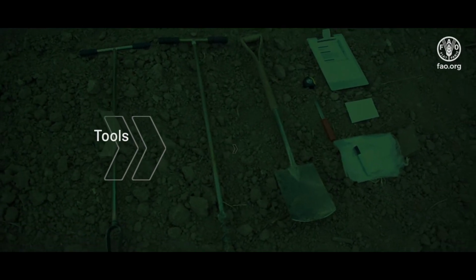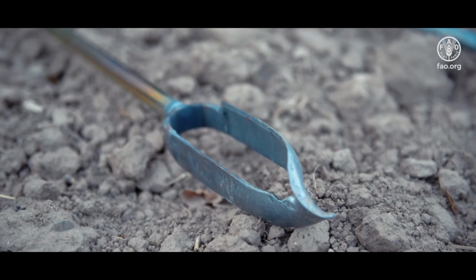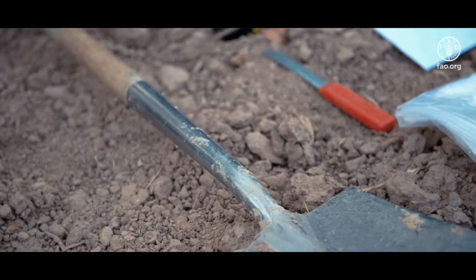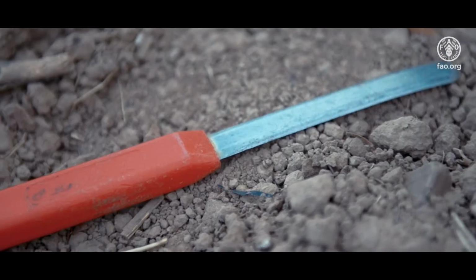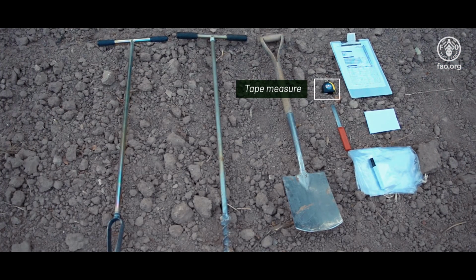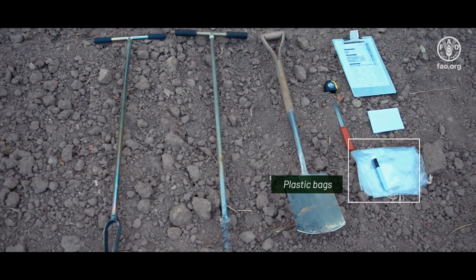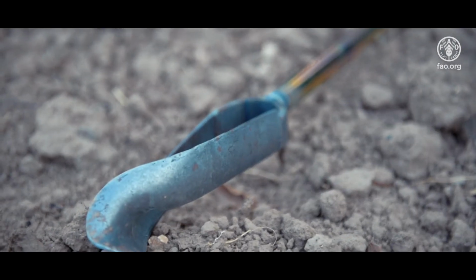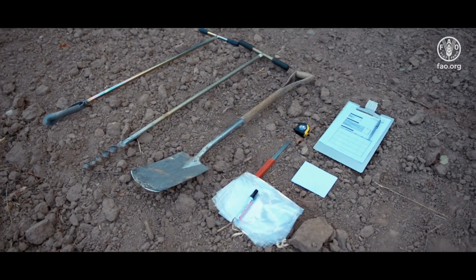First, you need some basic equipment. You can use a digging implement like a sharp shovel or an auger or probe. The implement most appropriate for sampling depends on the soil conditions. For example, in stony or wet soils, an auger or shovel will work better than a tube-type soil probe. In most cases, a shovel is the best option, since it's easily available. Other equipment needed are bags, a marker, etc. It is important to use clean sampling equipment before soil sampling.